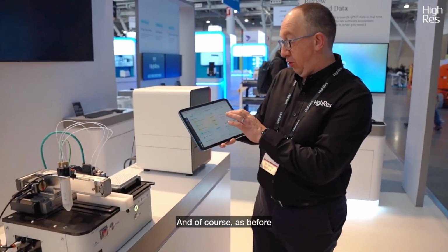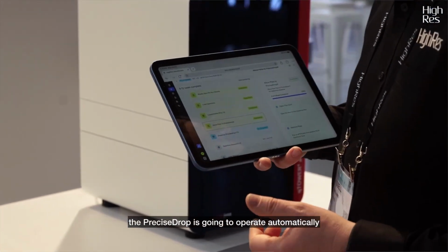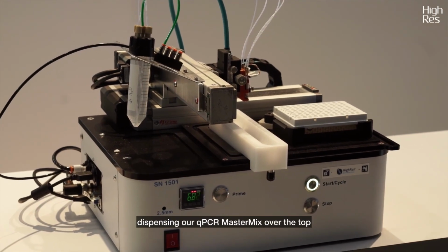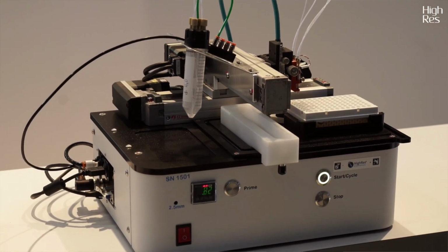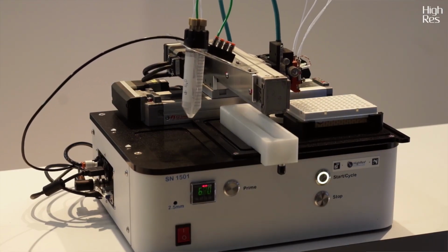And of course, as before, once I've completed that and confirmed that's ready to go, the Precise Drop is going to operate automatically. And all the Precise Drop is doing here is dispensing our qPCR master mix over the top of our serially diluted samples. So it's going to dispense a couple of microliters into every single well.